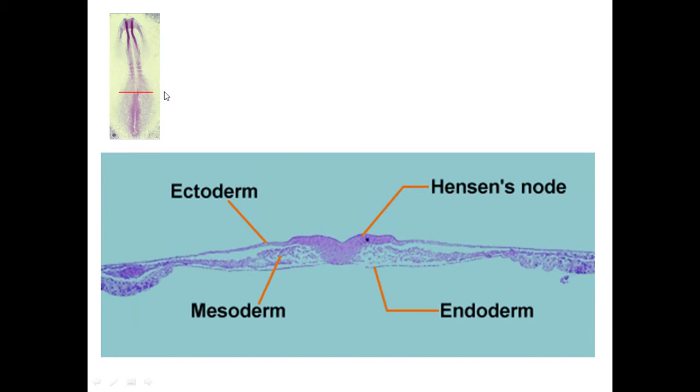Alright, so on this cut that we made along the anterior region of the primitive streak, if you remember a while ago, the Hensen's node, right? In the early incubation stages of the chicken embryo, this is found cephalic, but this time it's seen more caudal, alright? Because the primitive streak, as I've told you, is undergoing regression.